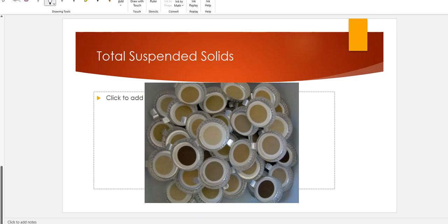Finally, a picture of total suspended solids. Here are weighing dishes that they have placed the filter papers into, and you can see a variation of the suspended solids on those filter papers. Visually, you know stuff is there because the papers often turned brownish, beige, and dark brown means, of course, probably very dirty, and lighter beige just means a little less dirty than some of the other options. But visually, you can see that, and that is total suspended solids, and that is method 160.2.